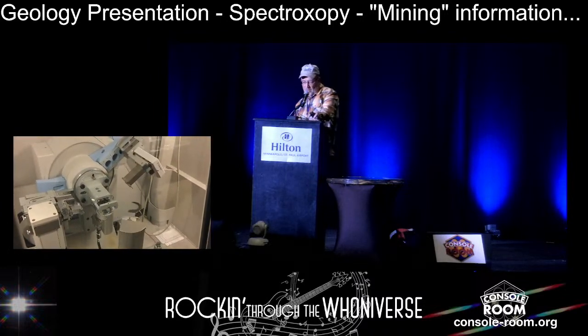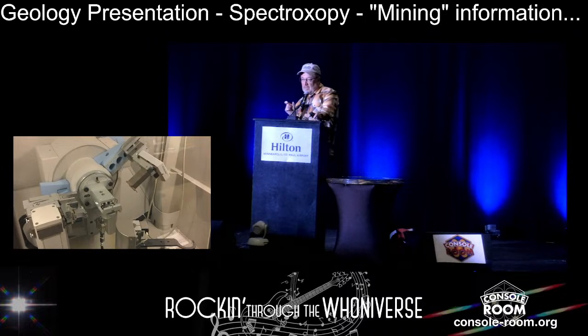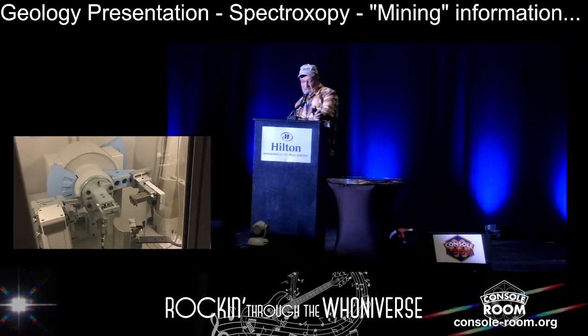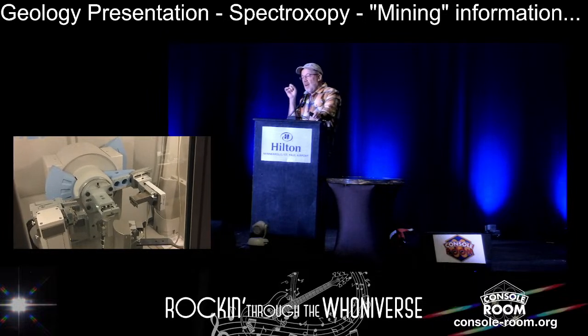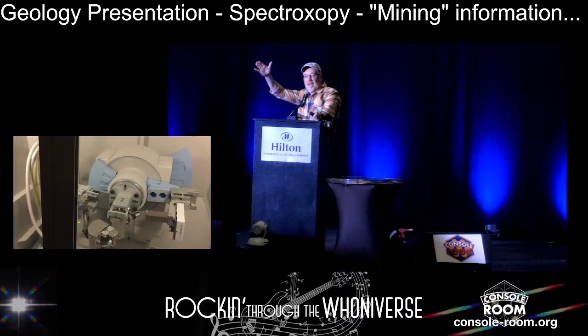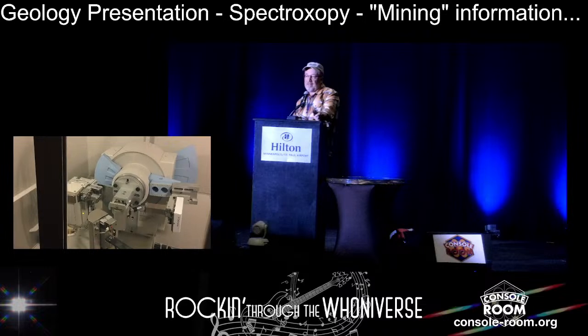So, kind of cool. The nice thing too about that is students can reach into or place it right there and not have to reach into the business side of things. I always tease them when we run this because it's locked. You're not going to get exposed to X-rays. I'll put my hand on the outside of it and say, oh, it's getting warm. And it's not doing that, but they don't know that.